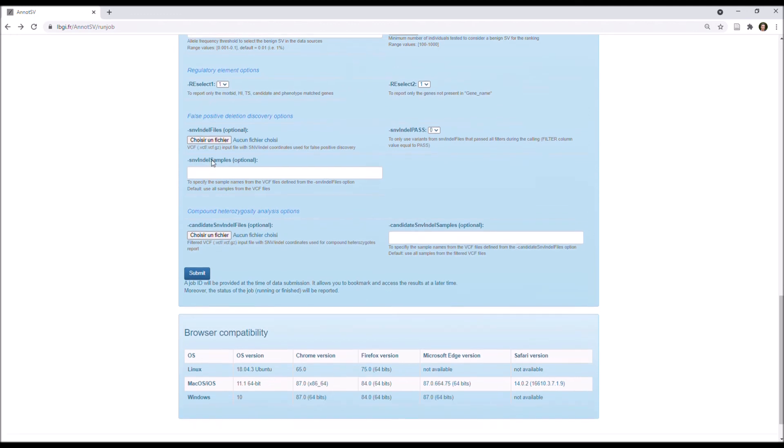Next, you have options specific to false positive deletion discovery, so you can upload a VCF input file with the SNV-INDEL coordinates from your patient.